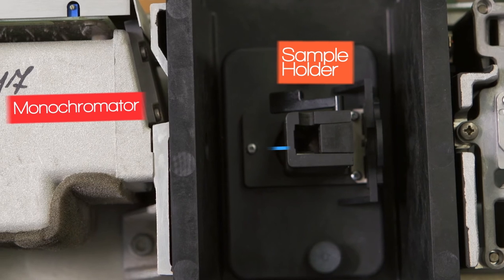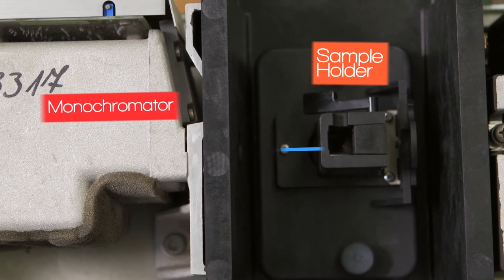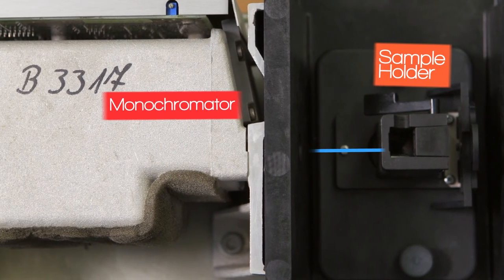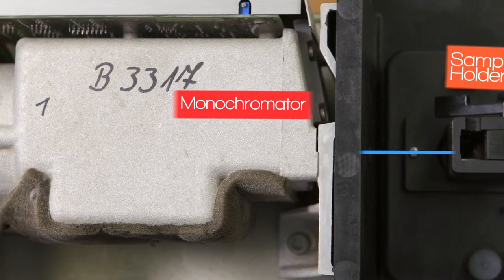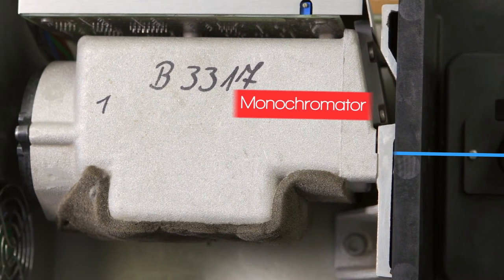Notice that the monochromator comes after the sample holder, rather than before it, like in the previous instrument. This means that the sample is illuminated with white light, rather than a narrow bandwidth.